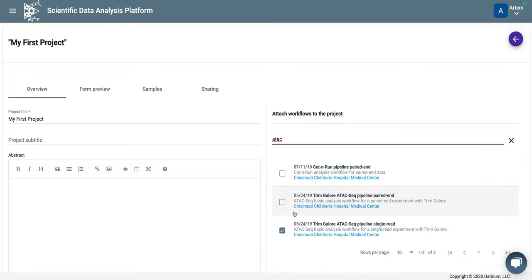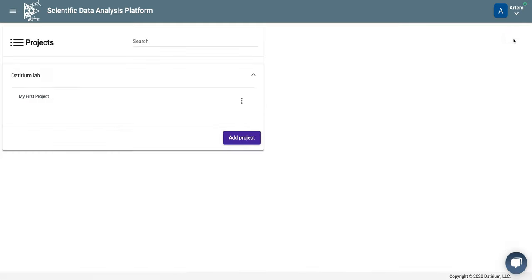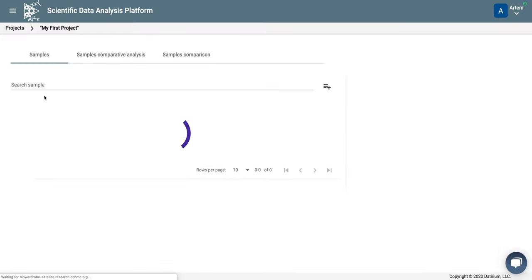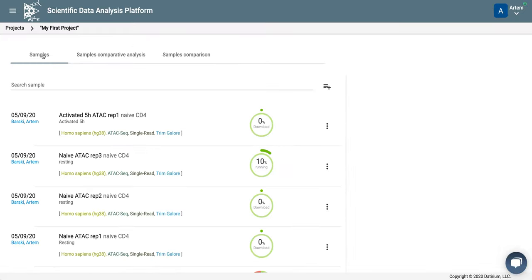So we search for ATAC, and indeed we have ATAC single read pipeline attached to our project. If it's not, we can do it by adding this checkmark. We click the back button and go into the project.